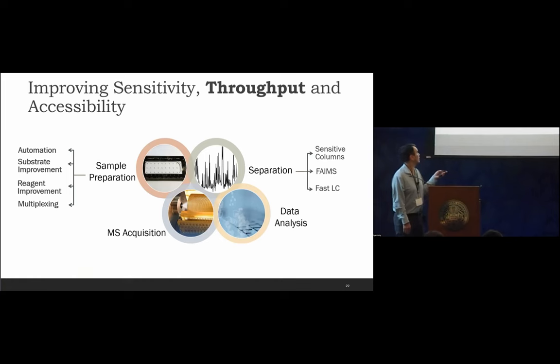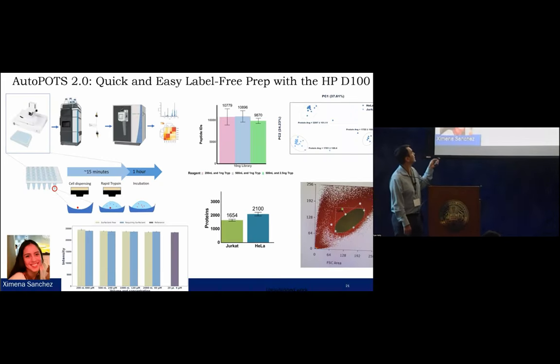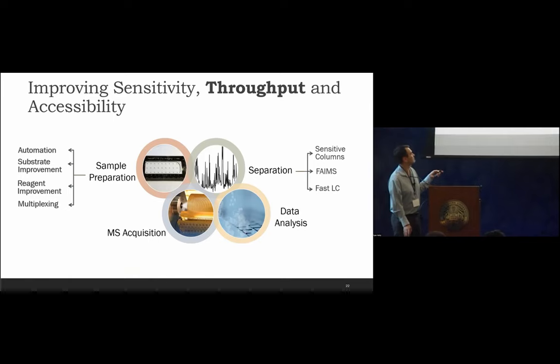This is a pretty low cost dispenser and well plates. So getting away, for certain applications, maybe not having to worry about expensive custom substrates is a nice thing.